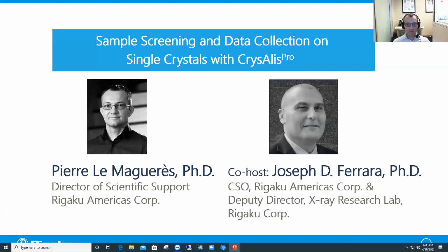What we're going to go through today is how to use CrysAlis Pro to screen single crystals, calculate a data collection strategy on them, and start a data collection. So I'm going to first switch the video display here so that now on your screen you should see a live display of the inside of our system with the goniometer, the sources, and the detector.